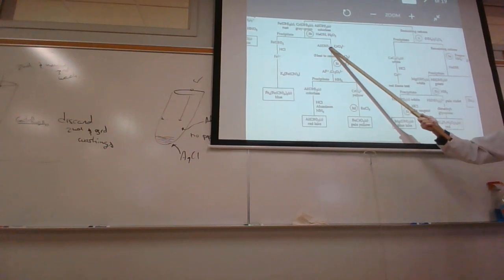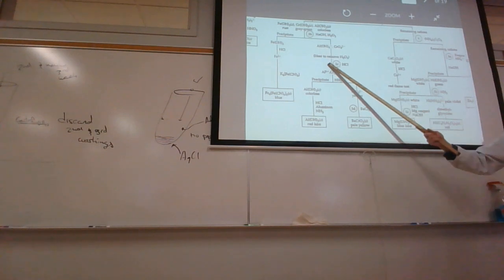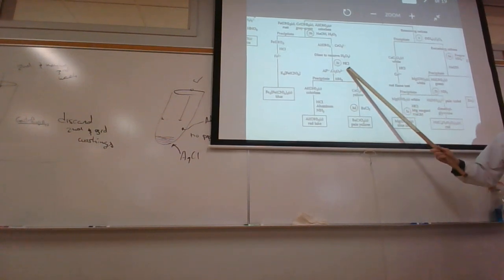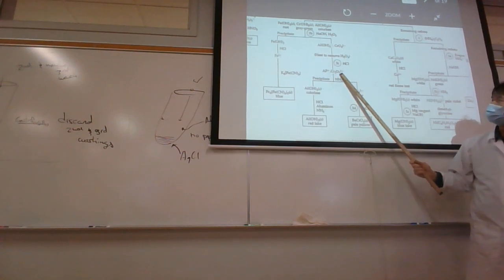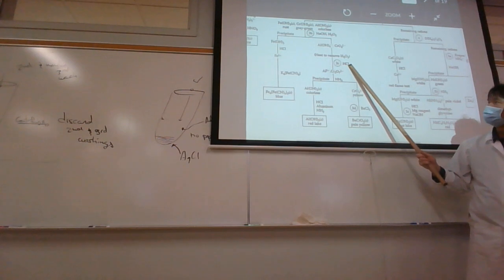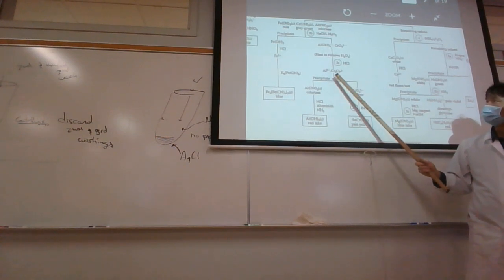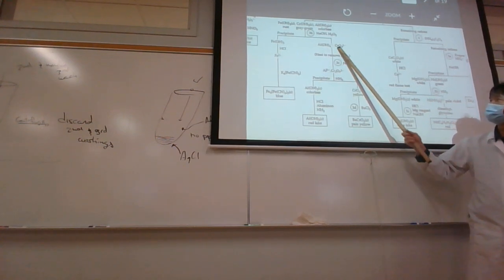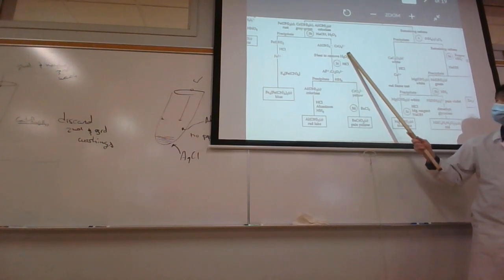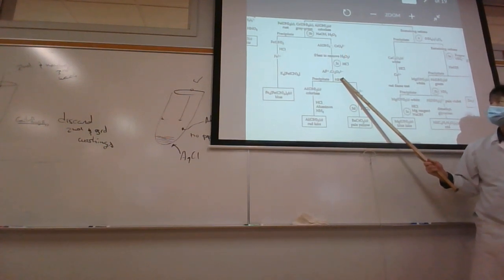The HCl is going to destroy the complex here, create aluminum ions. It's not going to do anything. Actually, it is. It's going to convert chromate to dichromate. So this is going to go from kind of a yellow to an orange color here. And so we get this acidic. You can tell it's acidic because of the color change. You can't tell based on the aluminum, but you can tell based on the color change of chromate to dichromate.